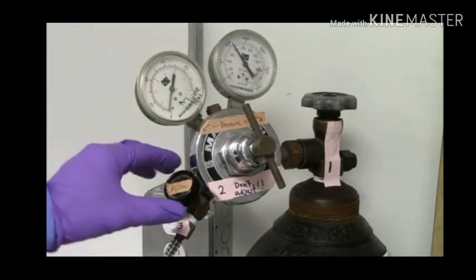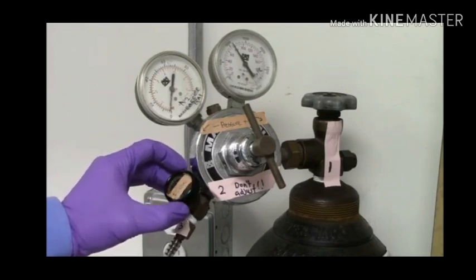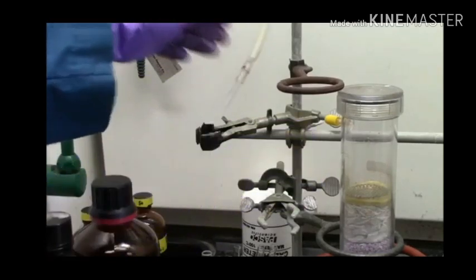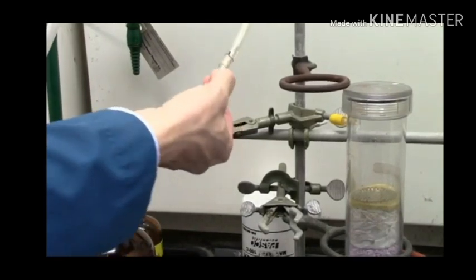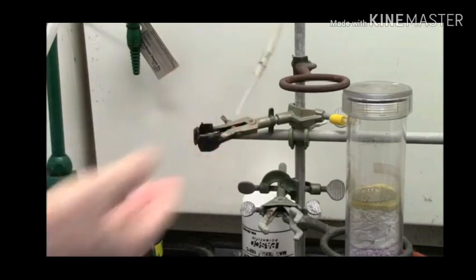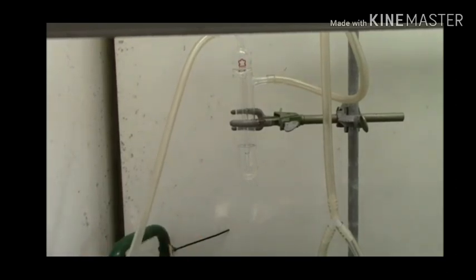Number 3 is the flow. This is a needle valve. It's sensitive. As I turn this, I'm increasing the flow of gas. The nitrogen will flow out of this syringe tip here. I'll have to feel it to adjust the flow rate appropriately. So I've taken off my gloves so I can feel the wind. Turning on the flow. I can feel that on my hand. It's a nice gentle stream of wind. That's what I want.